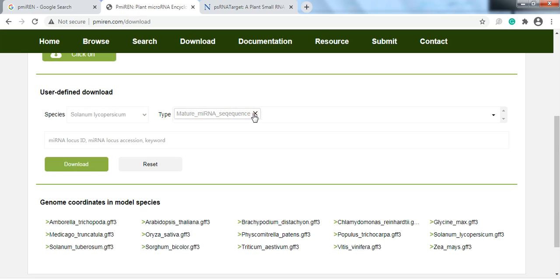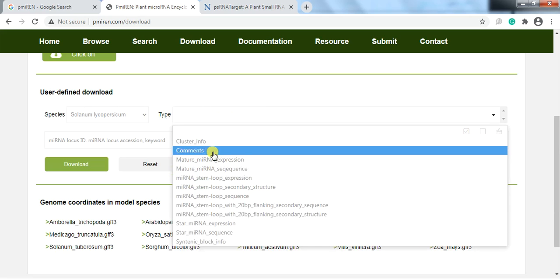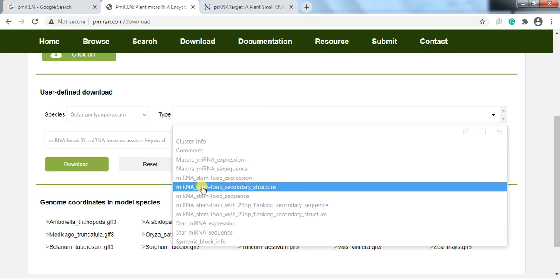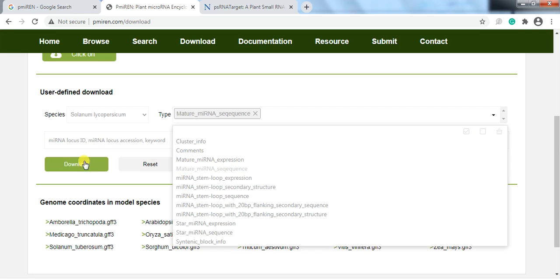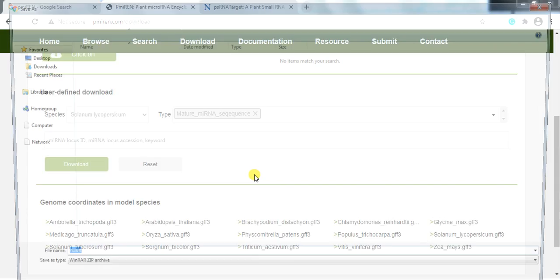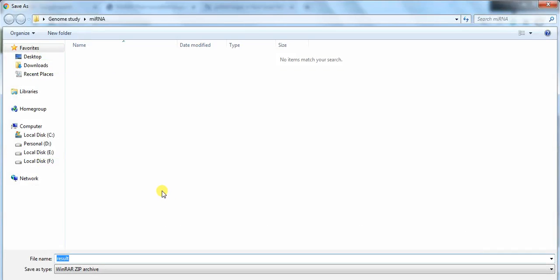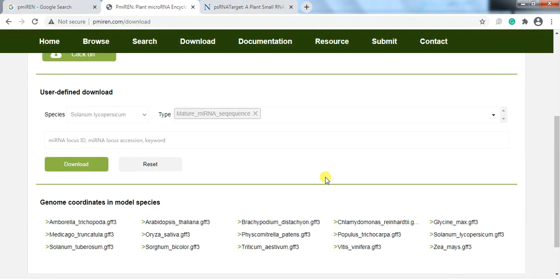There are many options available. We need the mature microRNA sequence, so click on it and then click Download. When you press Download, it asks for a destination folder. Save it into your destination folder — here it is the subfolder 'microRNA.' Name the file 'mature microRNA from Solanum lycopersicum' and save.